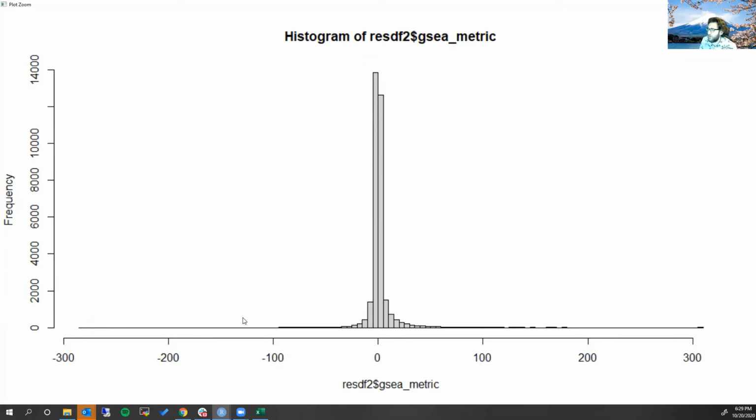What we want to do is take this rank distribution of genes and see if we can discover any gene sets that are overrepresented at the top of this list or the bottom. The top being overrepresented in the overexpressed genes, the bottom being the underexpressed.